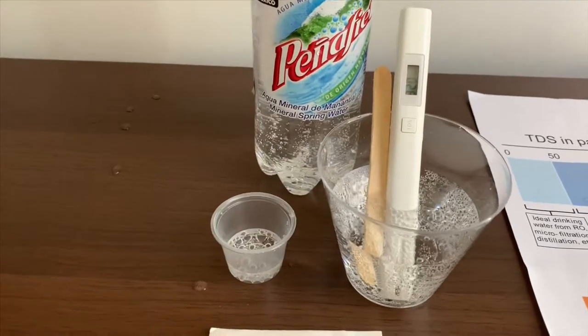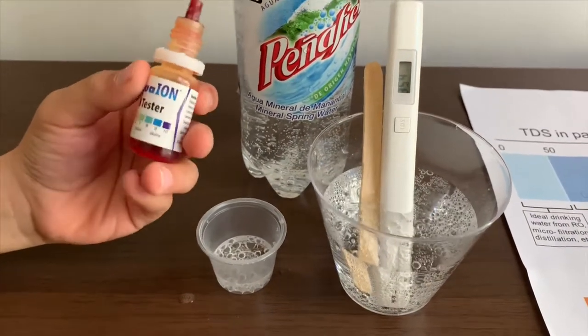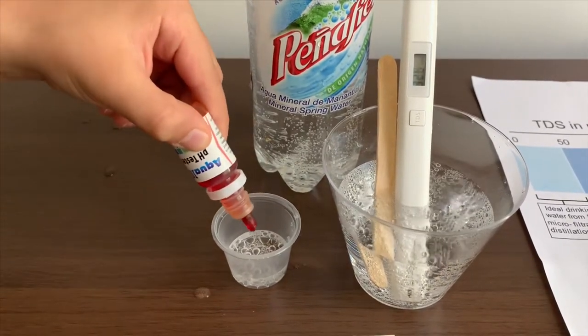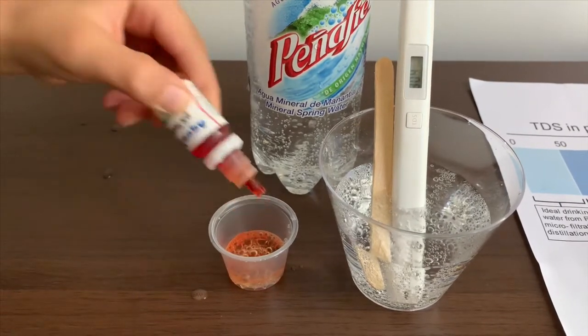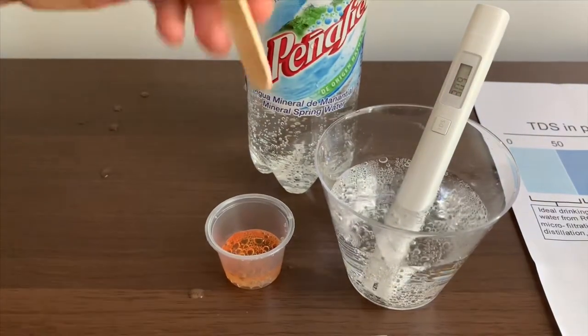Now let's test the pH level. If you want to buy this pH tester, check the link down below. Only do two drops. Let's swirl it a little so we'll get a better result.